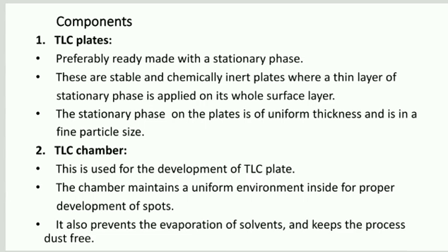These are stable and chemically inert plates where a thin layer of stationary phase is applied on the whole surface. The stationary phase on the plates is of uniform thickness and is in a fine particle size.